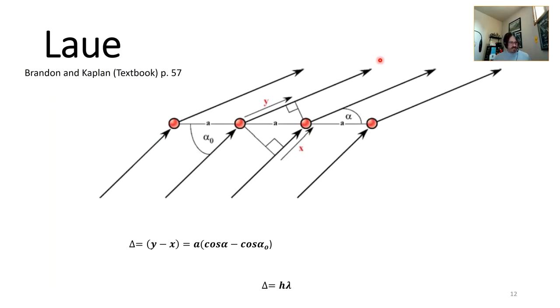And you have to remember, back when Laue was doing this stuff, there wasn't this fundamental knowledge of how material was arranged, of how atoms were arranged. This kind of atomic structure was still kind of being theorized, and they didn't really have the tools to analyze materials like we do now. So it wasn't factual to them that metals were arranged in a repeating structure, but his early experiments were shining light on the fact that materials were arranged within a repeating structure. So Laue came up with these equations. He realized that there's a path difference between the incoming and exiting X-rays.